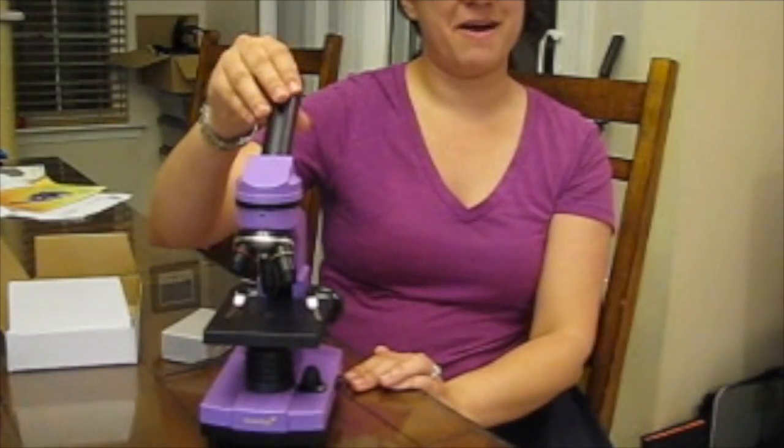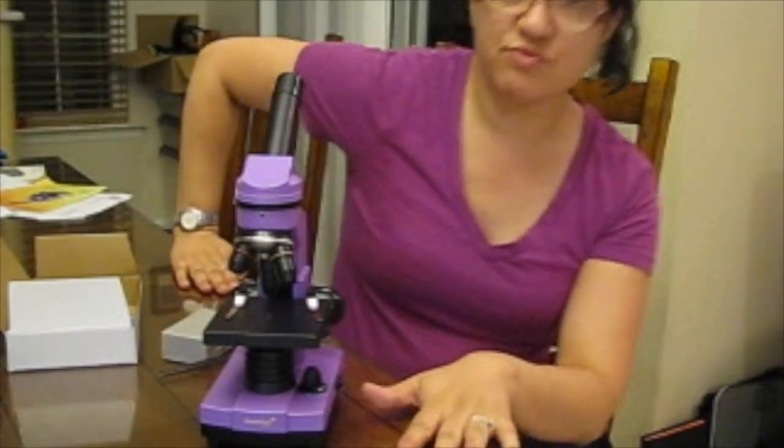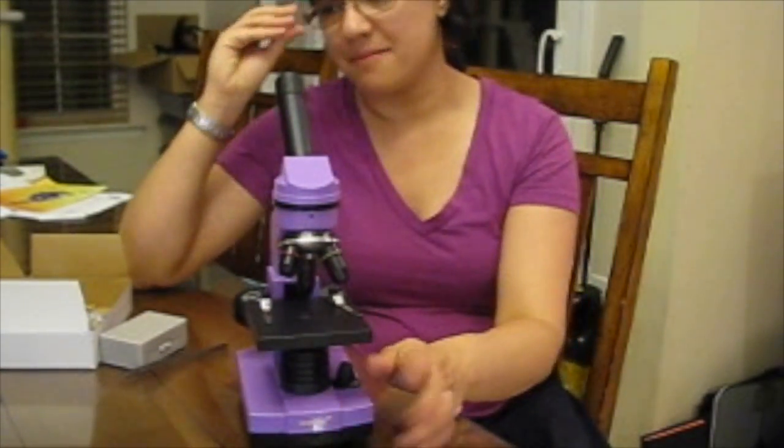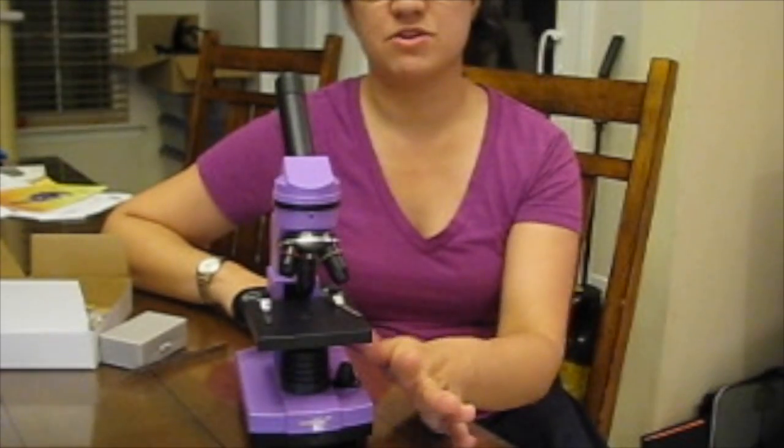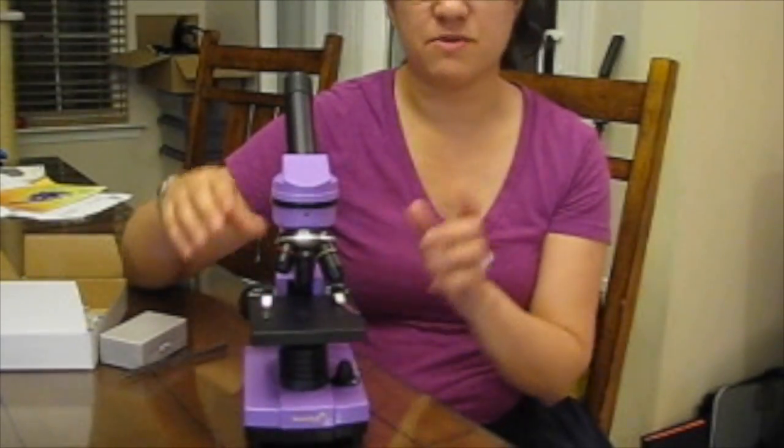So if it does come out, very easy to put back on. And I'm really impressed with the quality and sturdiness of this microscope. I've tried some others that were geared towards kids and they just felt like cheap toys. They really didn't work very well. This feels like a real microscope.